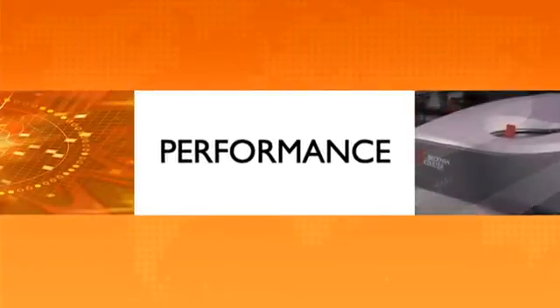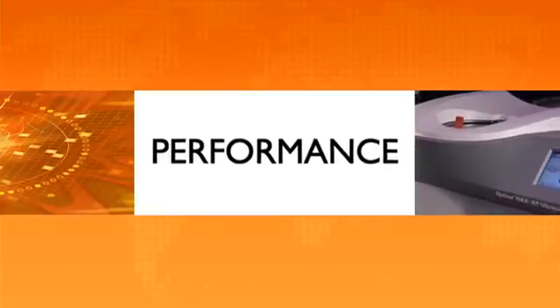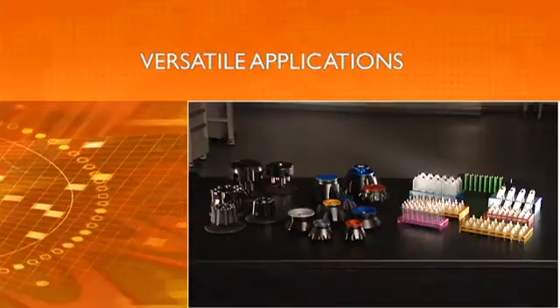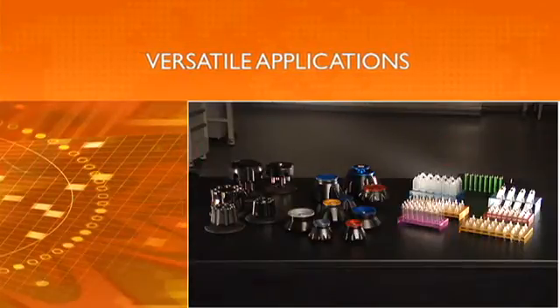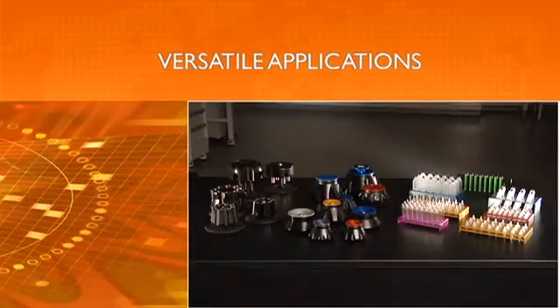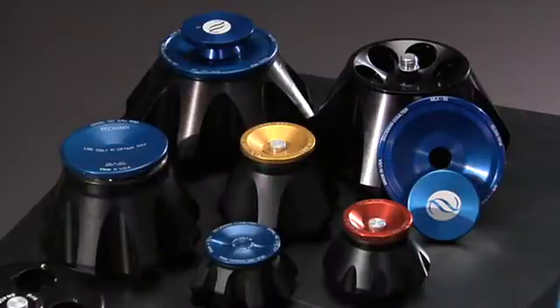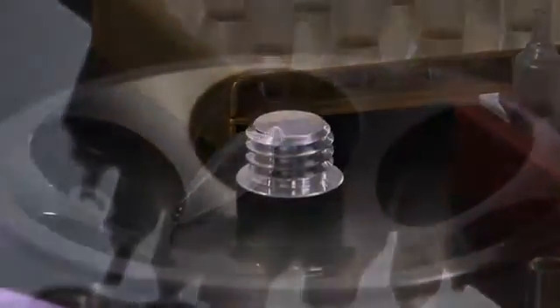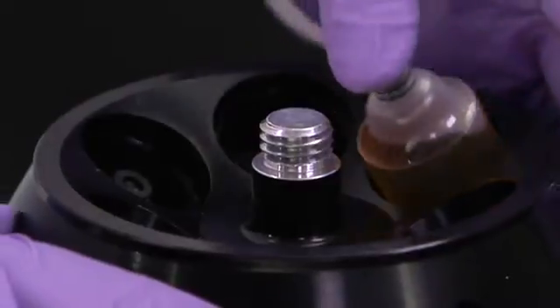The Optima Maxx series delivers the most comprehensive tabletop ultracentrifuge platform available today. The exceptional performance abilities of the Optima MaxxP, combined with our extensive selection of rotors, tubes, and labware, make it the ideal system for applications requiring high-speed and g-forces with volume flexibility, like viral vector gene delivery and nanoparticle applications.